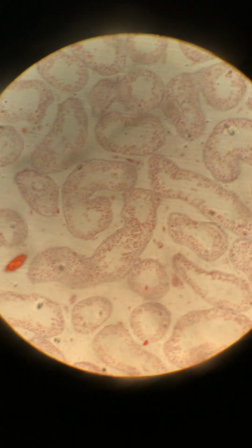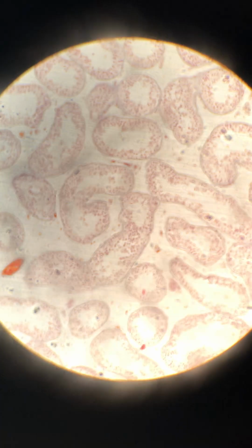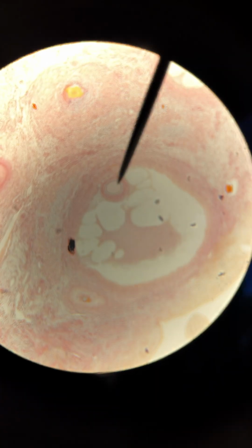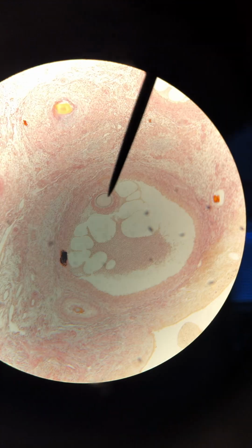10, I think, should have been pretty straightforward. This is the testes. And you can see the seminiferous tubules. If you just told me testes, that's perfect. 11 is a slide of the ovary. And the cell at the pointer is the oocyte.